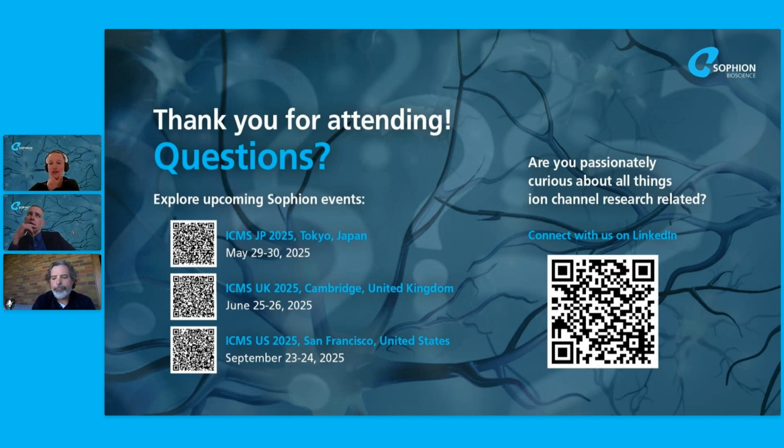Yeah, so for our experiments, the cells are dissociated and they have retracted their protrusions. I think there has been a bit of experimenting around culturing cells on the chip, but so far we cannot do that. So we work with the cells dissociated and they are sucked onto the patch hole. So they will be depleted of their protrusions.